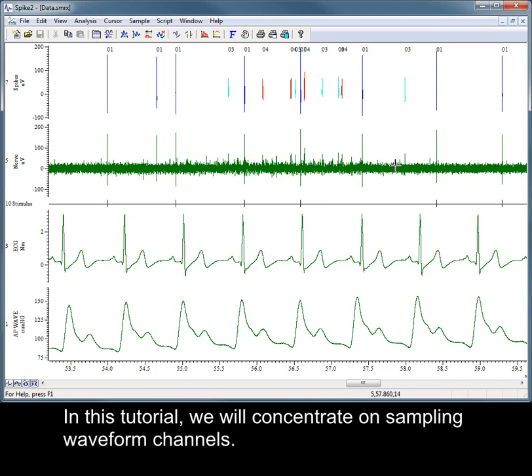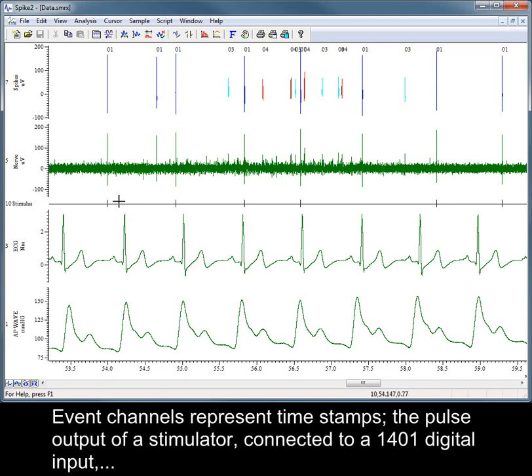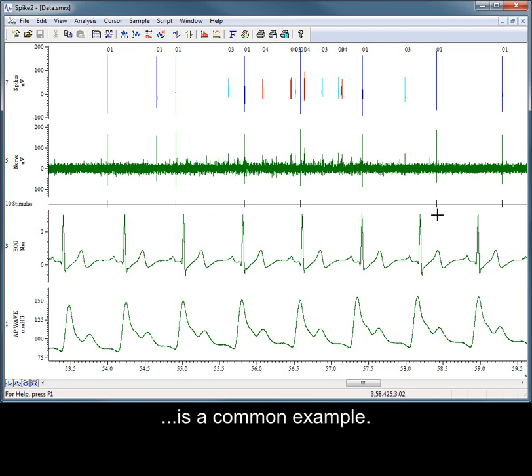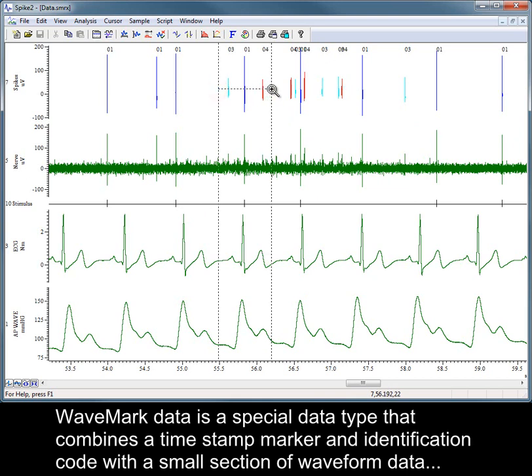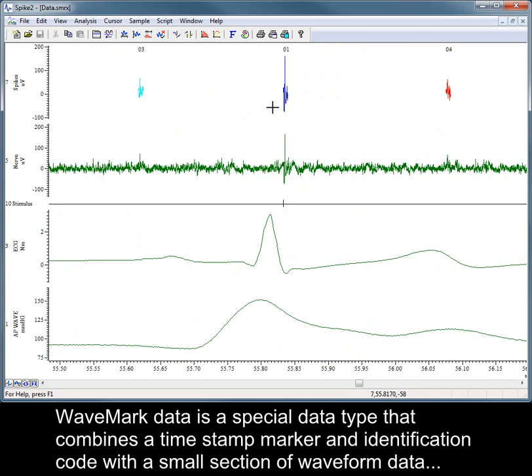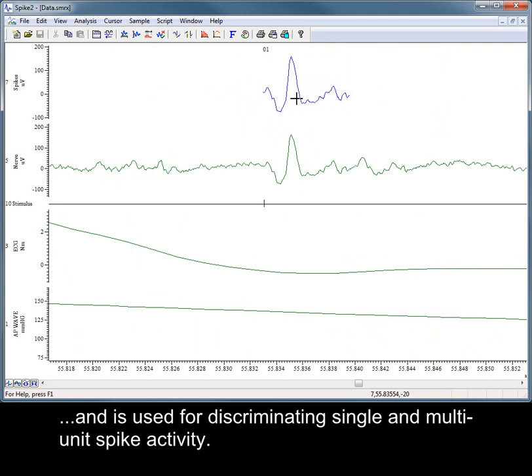In this tutorial, we will concentrate on sampling waveform channels. Event channels represent timestamps. The pulse output of a stimulator connected to a 1401 digital input is a common example. Wavemark data is a special data type that combines a timestamp marker and identification code with a small section of waveform data, and is used for discriminating single and multi-unit spike activity.